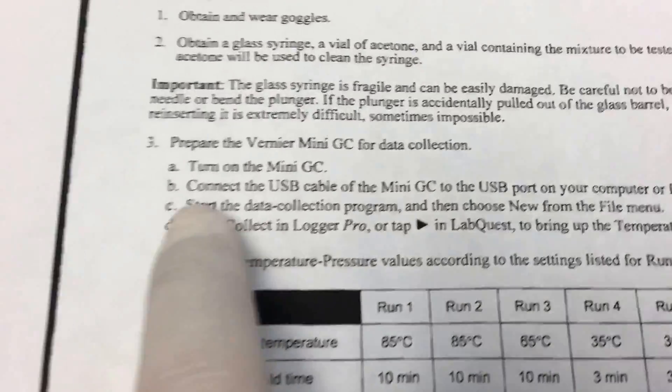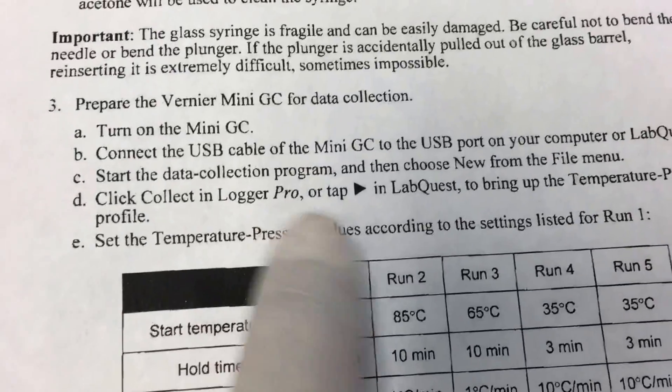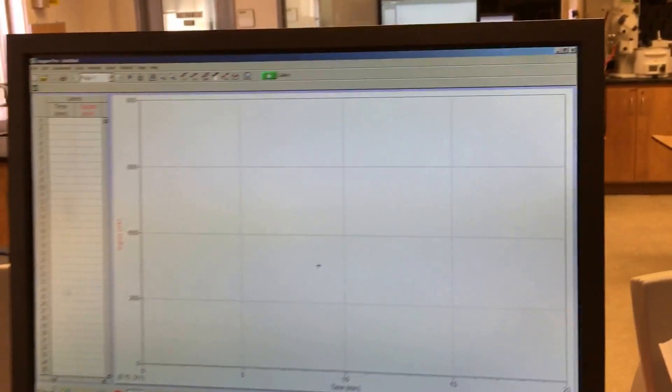First, turn it on, then hook it up via USB, click Logger Pro, tap into LabQuest, and your program will show up on the computer.